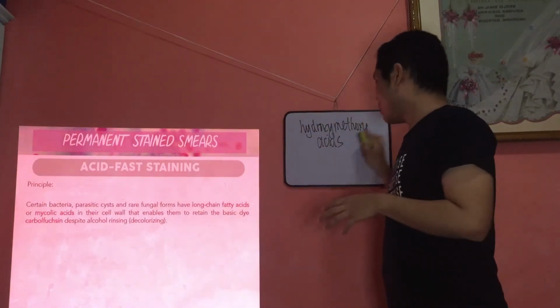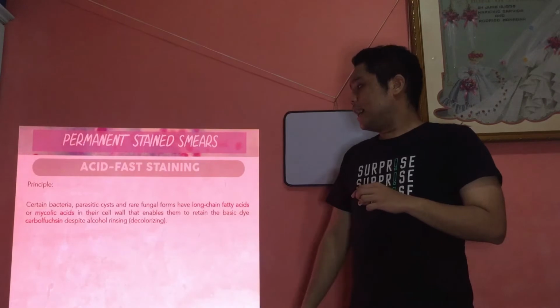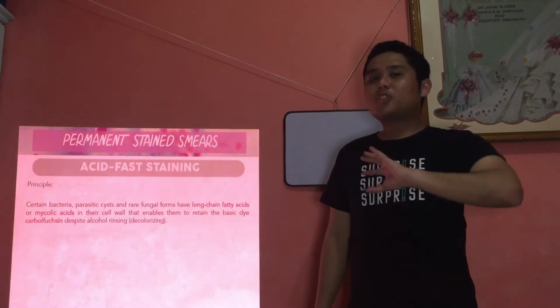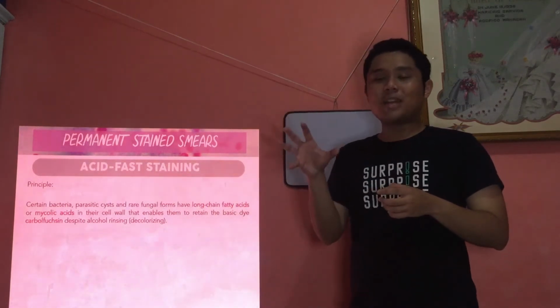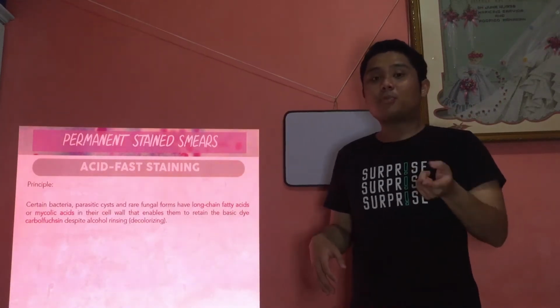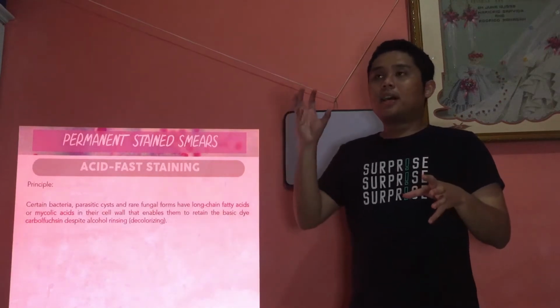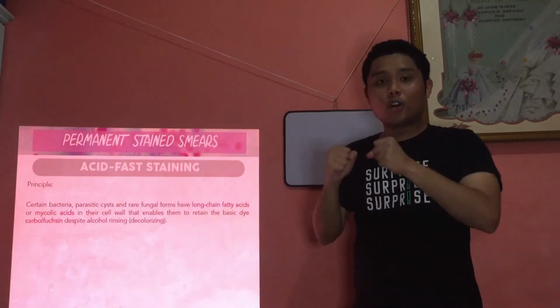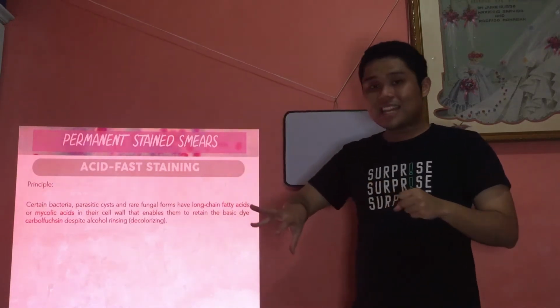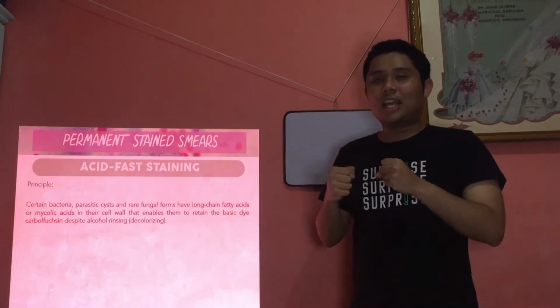Now, during staining, part of the procedure of acid fast staining is adding what we call an acid alcohol, which serves as a decolorizer. But during decolorizing, the carbolfuchsin, which is the first stain that we apply, because it's a differential stain so we use two stains, will not be washed out. Because of the long chain fatty acids in their cell wall, they will capture and hold on to the carbolfuchsin. That's why when acid alcohol is added during decolorizing, the carbolfuchsin is simply retained. That's why it's called acid fast.